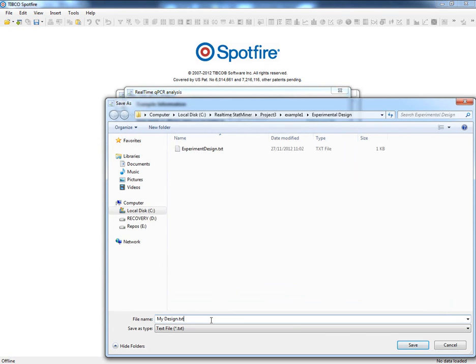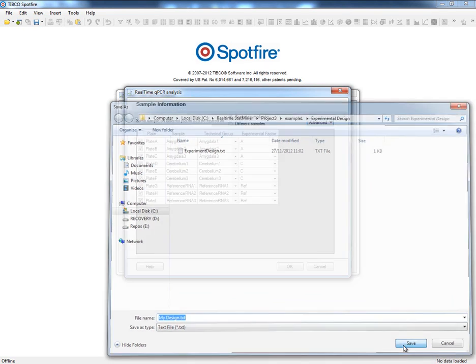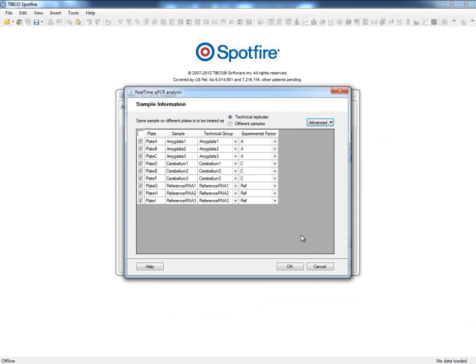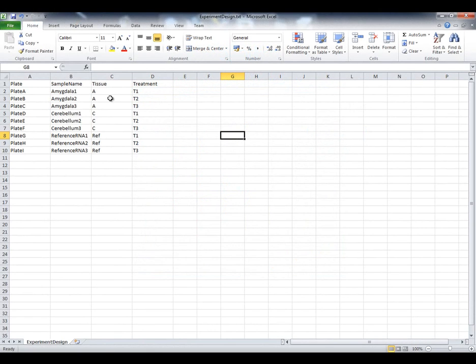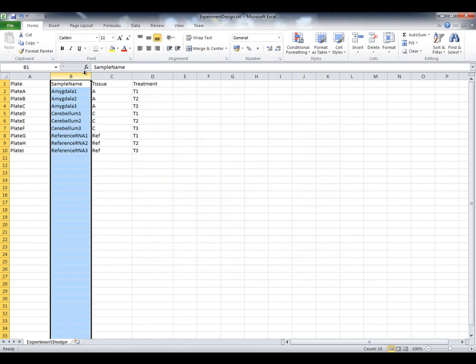Since we're using the first option, we have to define our experimental design, assuming we have a tabular text file with our design configuration. Let's reset our design to show how it works. It doesn't matter if it was generated by a former save to file functionality or we already have it, it just needs to follow this format.